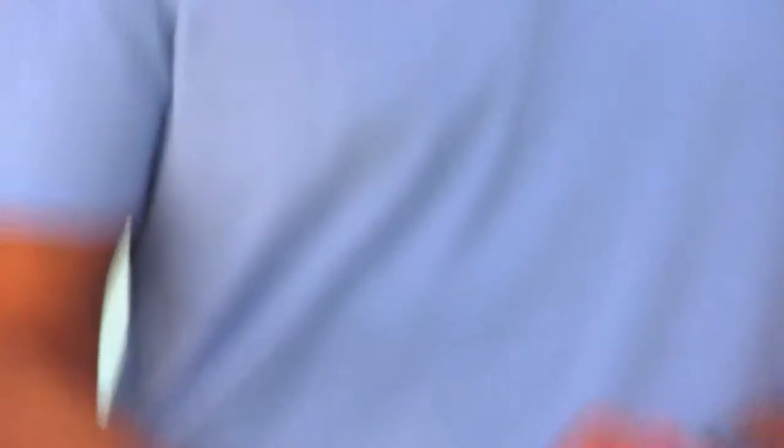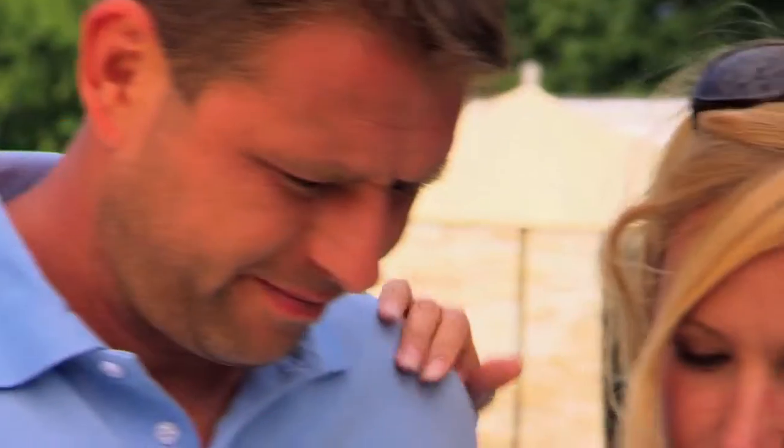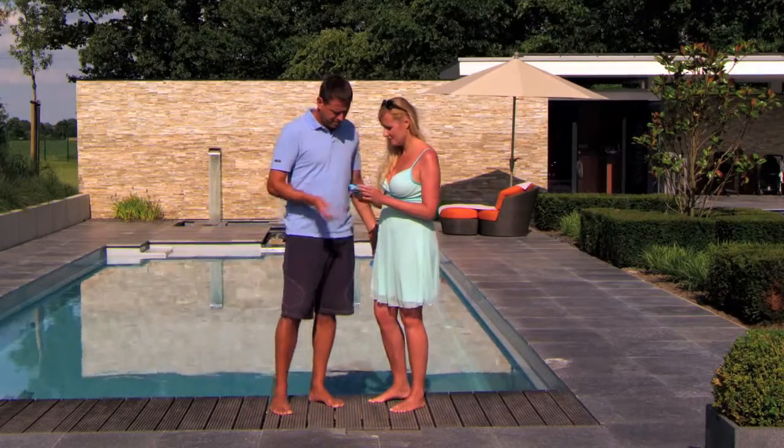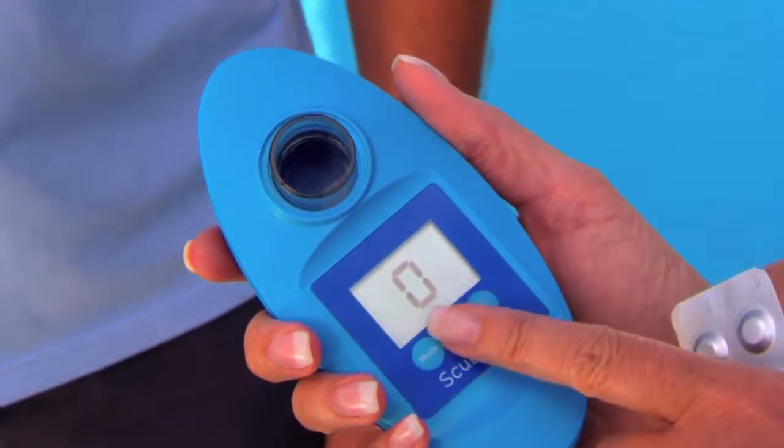But we don't take a chance on the water quality. With our Scuba 2 Pool Tester, we're in control. It really is so simple. I just take some sample pool water with my scuba, put the tablet in here, select menu, press test, and that's it.